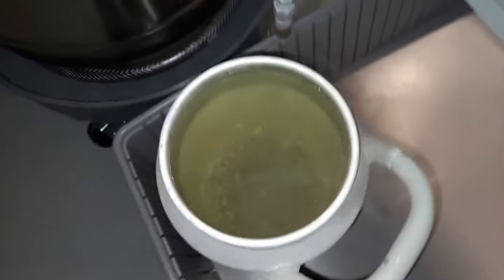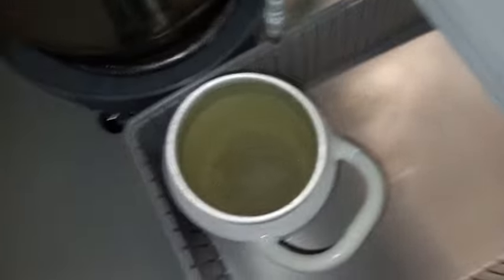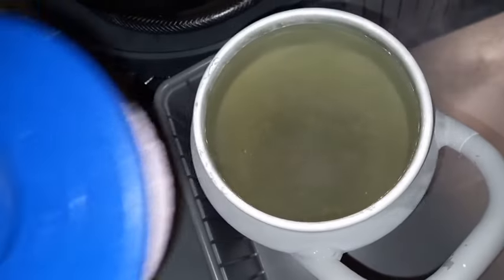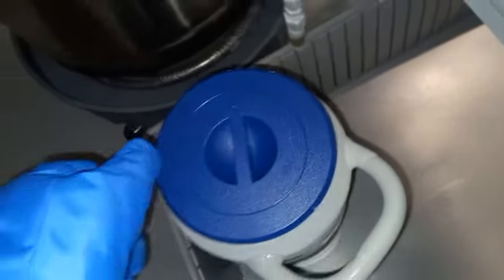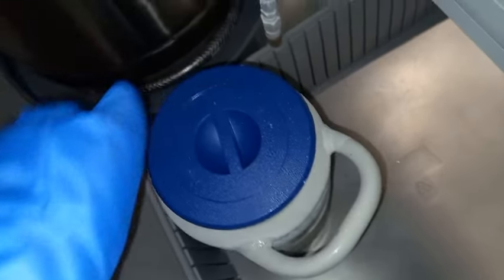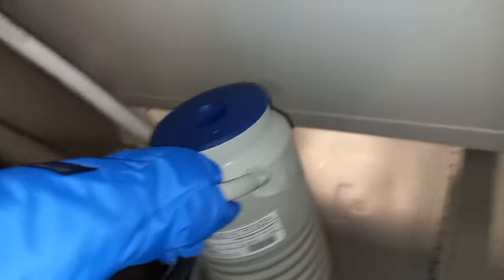Here we can see the liquid nitrogen boiling at room temperature in the thermos, and you can see frost building up on the liquid nitrogen refilling tank. Now I just need to put the lid on top — it doesn't seal tightly on the thermos, it's kind of loose like that. You don't necessarily want to fill the thermos all the way to the brim.